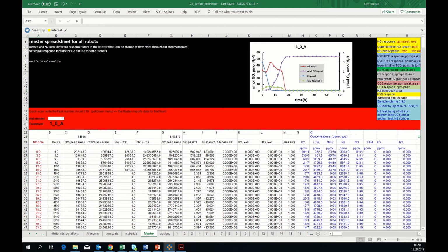The sheet also has another important feature, and that is that it can be used to inspect all the vials. You decide which vial number you will inspect by the value in B19. As you see here, I have the value number 1. That means that the data that I've plotted here, I have a plot from the result file, the simple plot that I showed you previously, copied and pasted up to this place here.